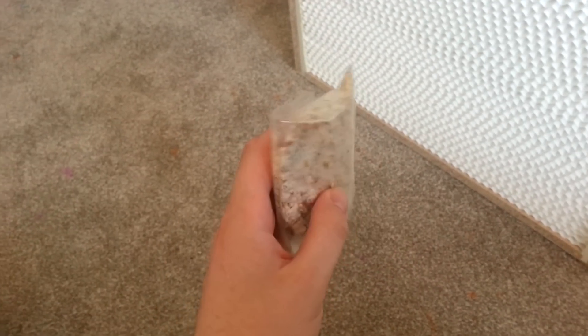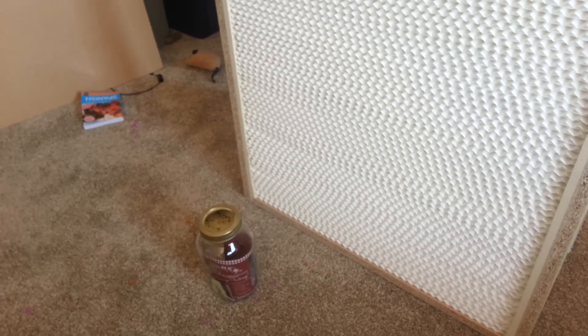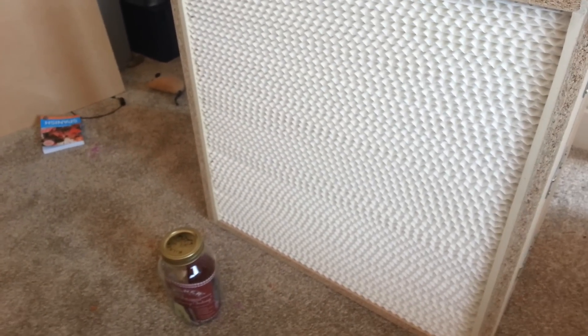To understand exactly what you would do here: say you had some mushroom mycelium and you had a jar. Let's pretend this is full of grain and you want to put this mushroom mycelium into the jar full of grain, which has been pre-sterilised, without getting it contaminated. There are mould spores everywhere. I've tried growing mushrooms, just opening the jars in the kitchen, but they always seem to get contaminated with forest green mould.